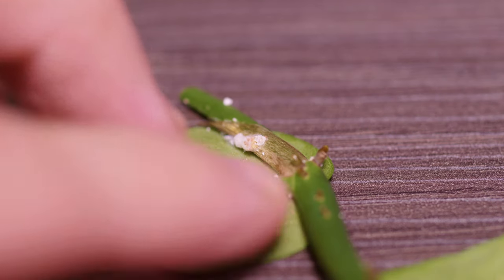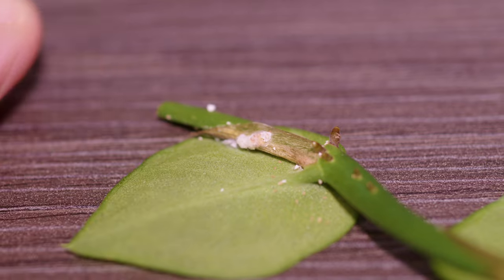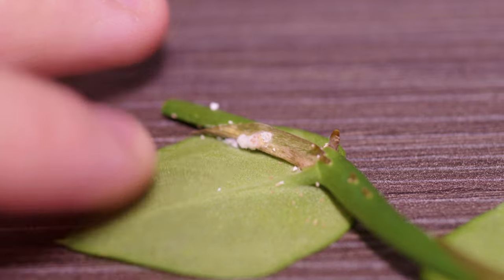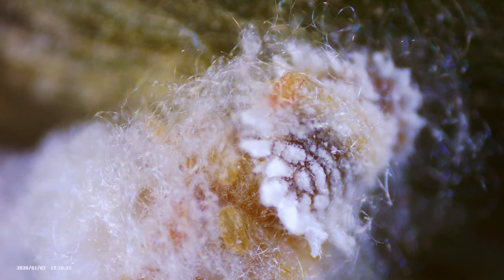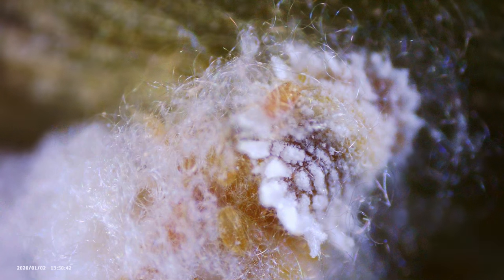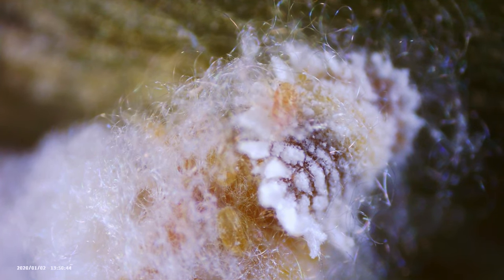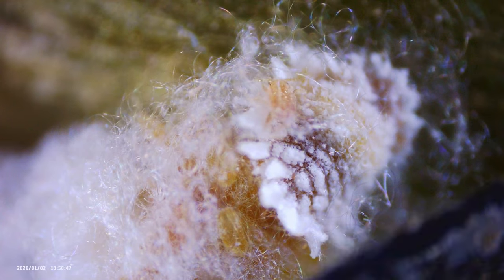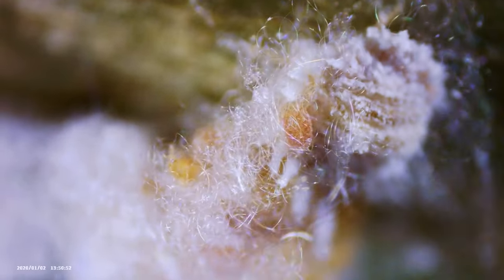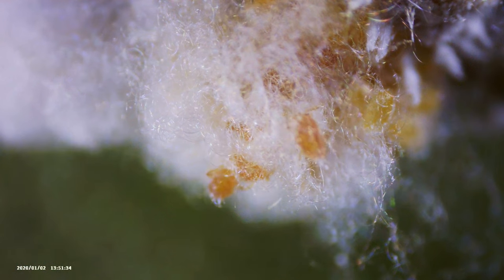Lastly, let's take a look at some mealybugs. Here's an example of what they look like from far away — usually once you see almost snow or little white splotches on your plants, you can almost guarantee it's mealybugs. There are very few pests that look like this. You can see these mealybugs have been living here for quite some time because they've straight up built nests. It's best to find them before they start laying eggs, because once all the little babies hatch they get into the cracks and nooks and crannies of your plants, making them really difficult to get rid of.